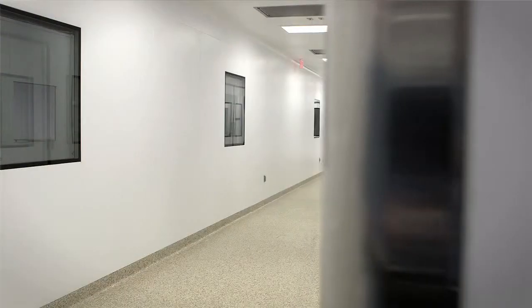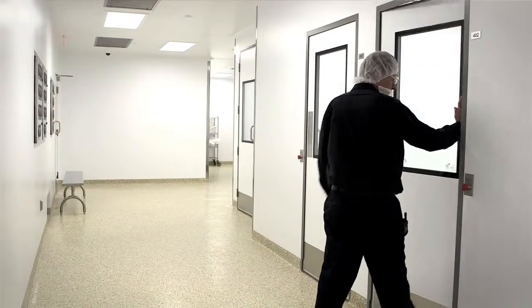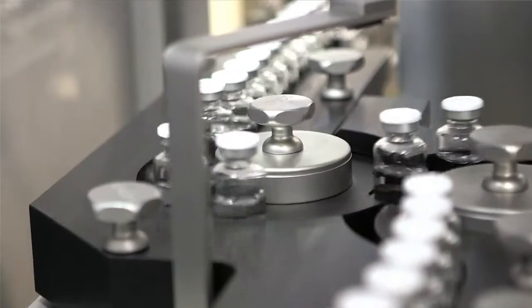In addition to just a manufacturing facility, we are constructing a freeze-dry facility, a compounding area, as well as a wash area to support this new technology.